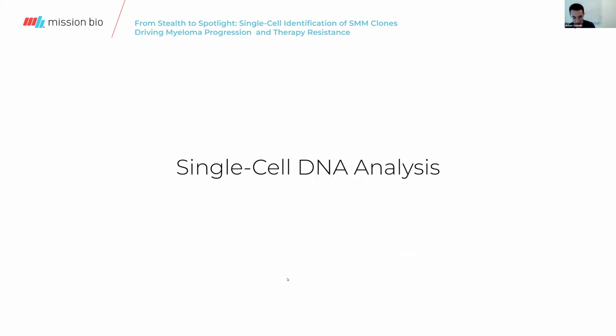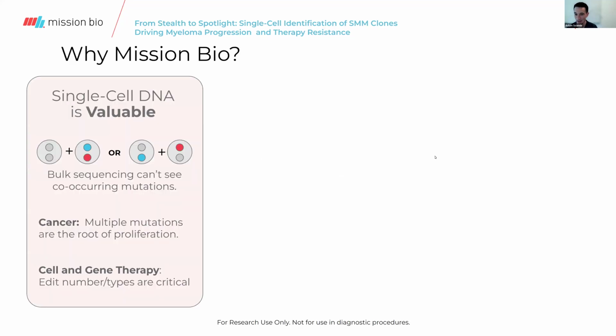So that's sort of a primer to multiple myeloma. I'm now going to breeze through our single-cell DNA analysis platform, sort of how it works, and then we'll get on to the multiple myeloma study. So Mission Bio, how are we able to do this? Why do we do this?